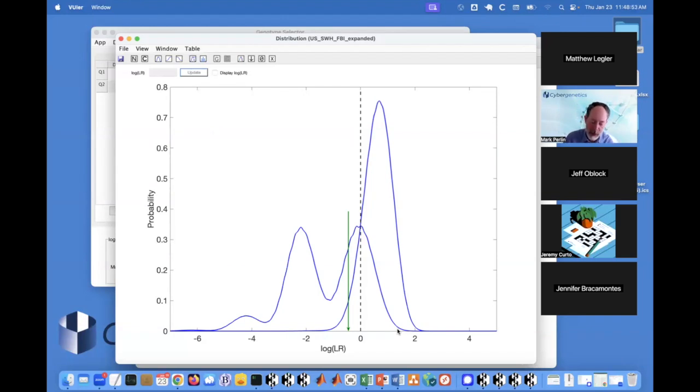So when you don't give the system enough data, and 24 peaks over 21 loci is not much data for a mixture, you'd ideally like to have 3 to 4 allelic peaks plus stutter, the result is the system really isn't able to distinguish between contributor and non-contributor. And the distributions give what I think is the clearest answer to what's going on when you don't give a Bayesian system enough data.